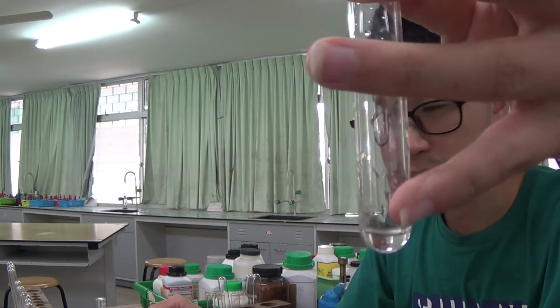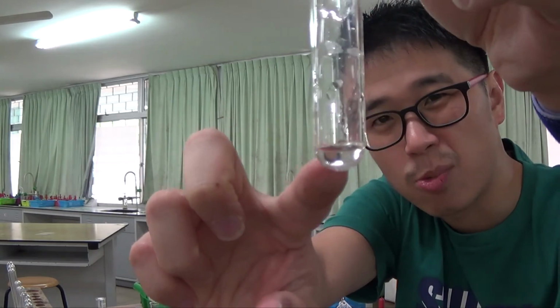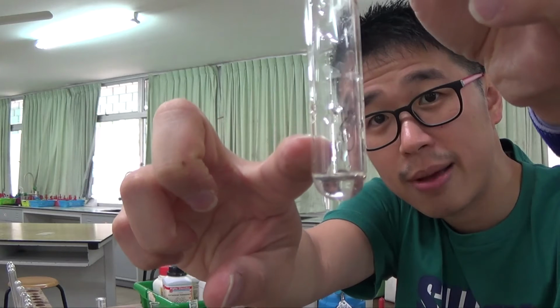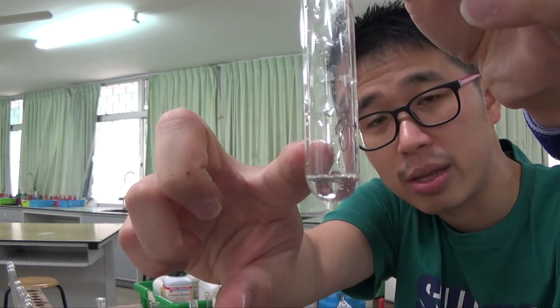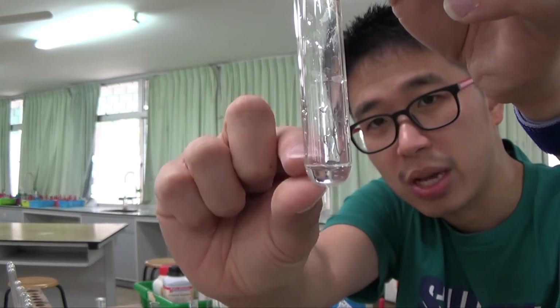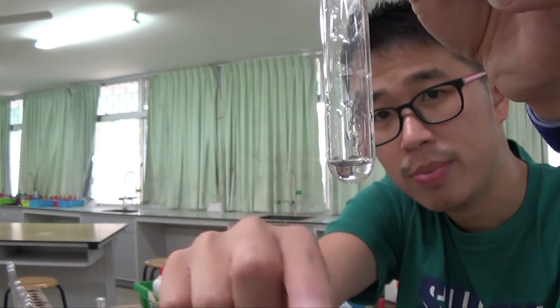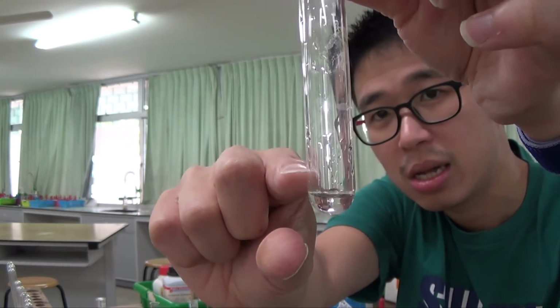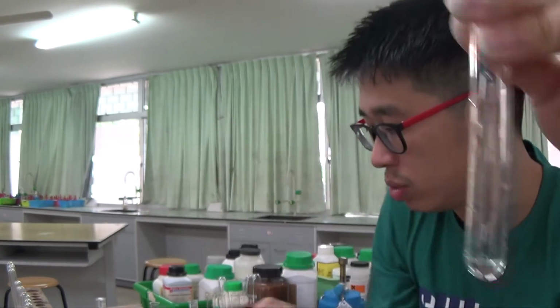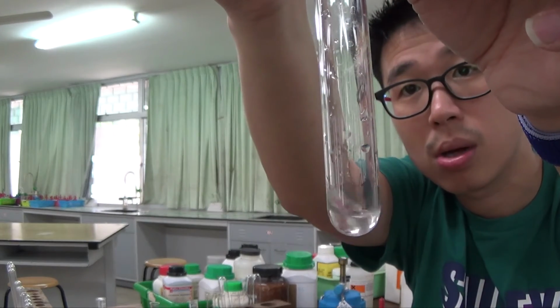When you first add sodium hydroxide, you want to add it drop by drop because you want to see what happened. So this is less than 1 cm3. 1 cm3 is around there. So typically when you add at first, before you add in excess, you need to add the same volume. So if I use lesser volume, then I'll add up to there, which is almost double the volume. If I use 1 cm3 here, then I will add up to there, which is almost 2 cm3. Okay, so it depends on how much you have in your test tube.